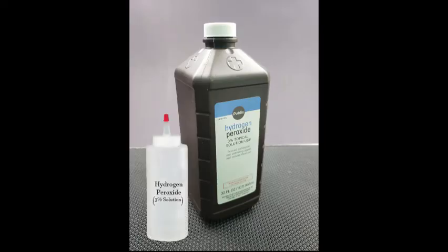Use a clean graduate cylinder to measure and pour 30 drops or 1.5 milliliters of hydrogen peroxide into each of the five test tubes.